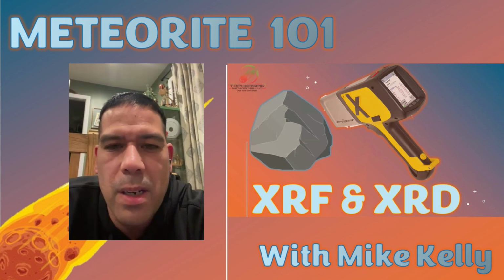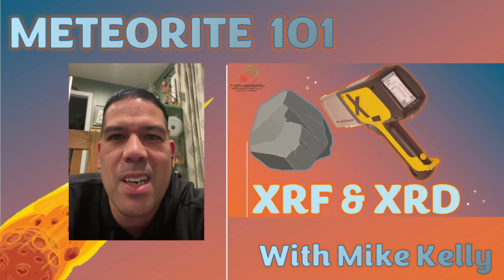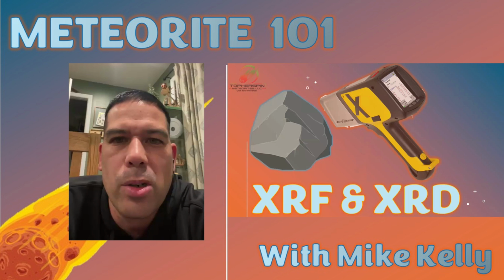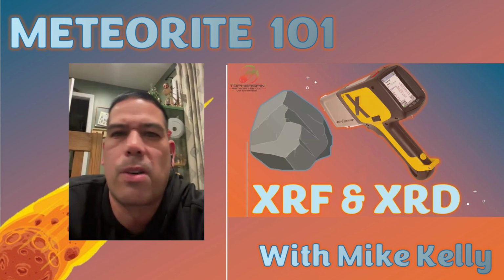And like I said, it is a good tool. Again, they're expensive machines, but if you can find a source where you can get it done, it's a good indicator past just visual that you could use in making an assessment of, do I further want to take this and then turn it in for classification.